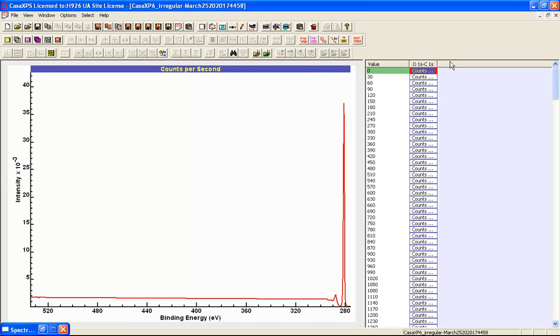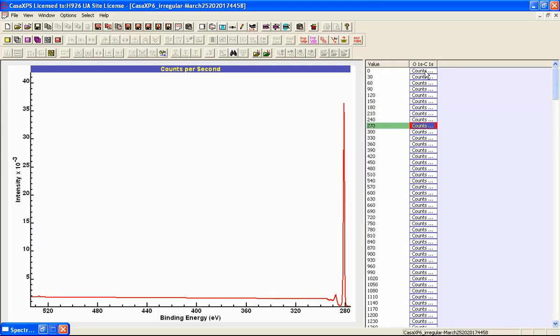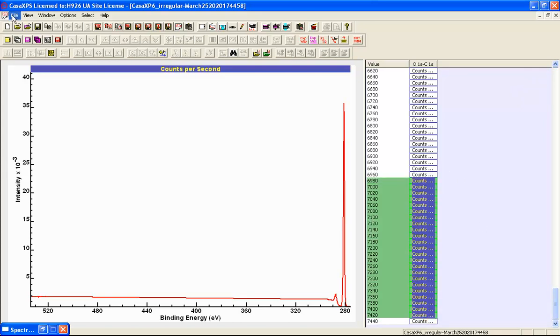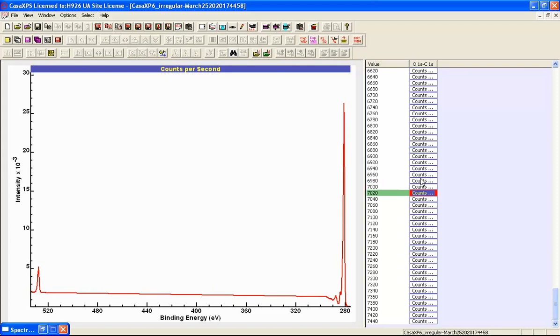At the start of the depth profile, the separation of these two polymers is much clearer. As we step through, we see the oxygen in particular increases and then disappears again, and this is an indication that we do have separation of these two polymers, at least in the first few cycles of this depth profile. However, over the same interval at the end of the profile, we can see evidence there's oxygen in all of these cycles, which suggests that the polystyrene and the PVP are being measured at the same time over these cycles within the depth profile.